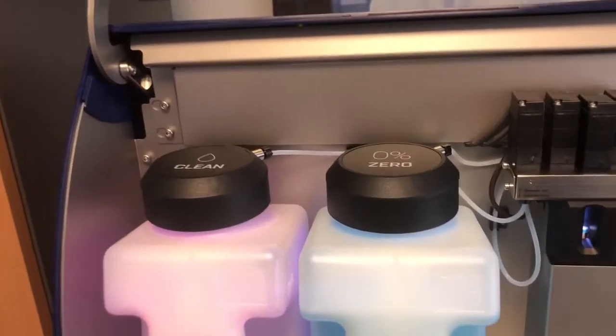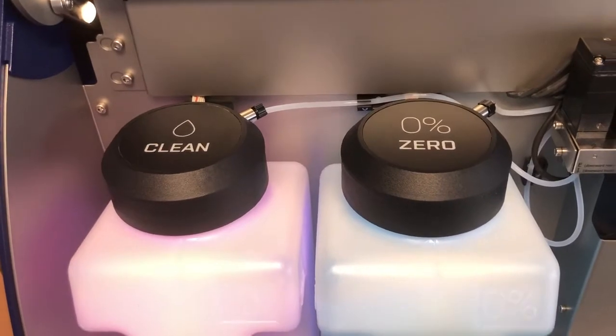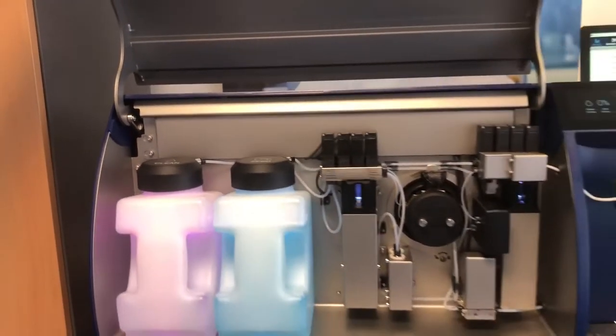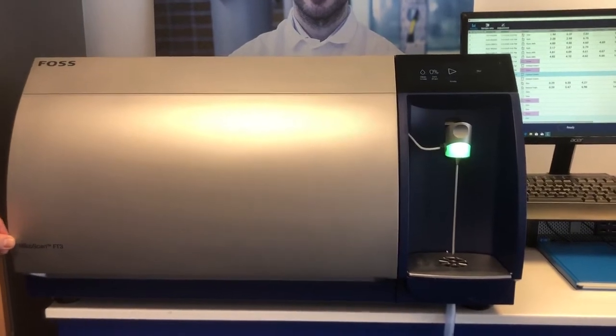As you can see, the zero and clean bottles are now colored to help the operator tell which is which. There are also diagnostics that will alert the operator if they have the clean and zero mixed up on the instrument.